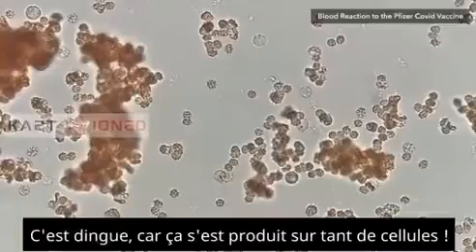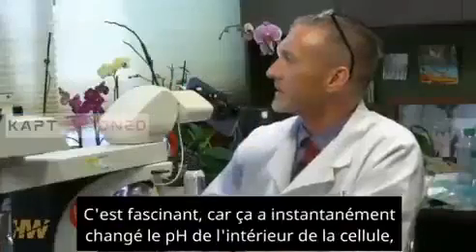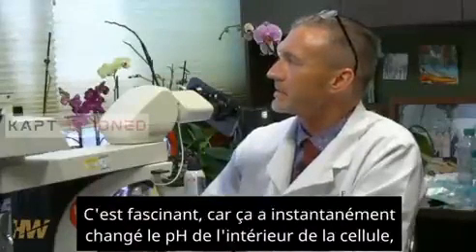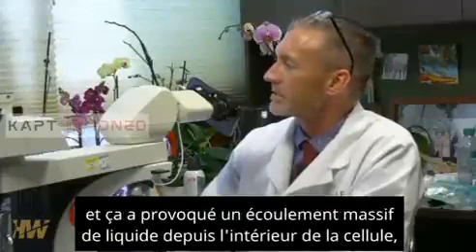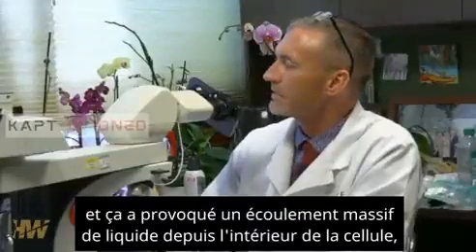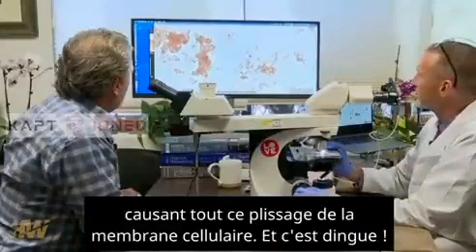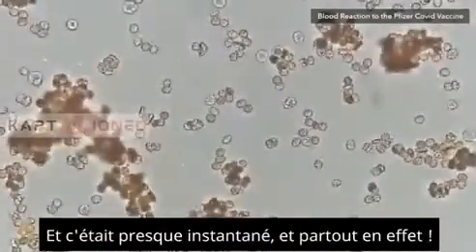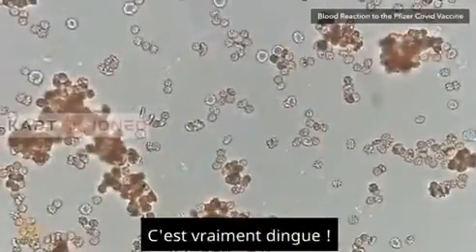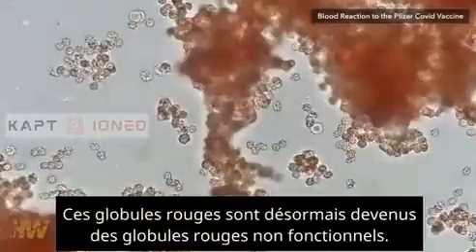Well, I mean, it's crazy because it's done it to so many. We didn't see that on the other ones, right? So that's fascinating because that instantly changed the pH of the interior of the cell, and it caused a massive outflow of fluid from the interior of the cell, causing all that cell membrane folding. That's wild. And it was almost instantaneous. And it is everywhere. It is everywhere. So that's wild. Those red cells are now non-functional red cells.